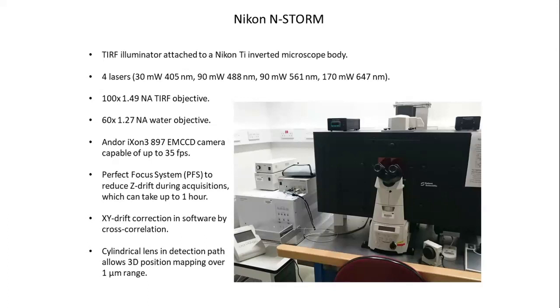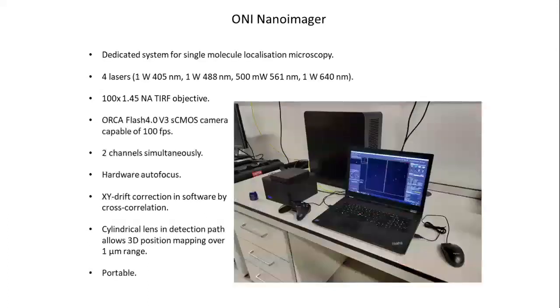This is actually our latest version. That's effectively what I just showed you, all squashed into that little box there. But this is something that you can have actually in your own lab. It's portable, so it's up in the Allegretti lab at the moment. But same sort of idea. It's just a state-of-the-art version of a STORM microscope. But what it does have is much bigger lasers, so we can do all that optical switching stuff a lot more quickly.